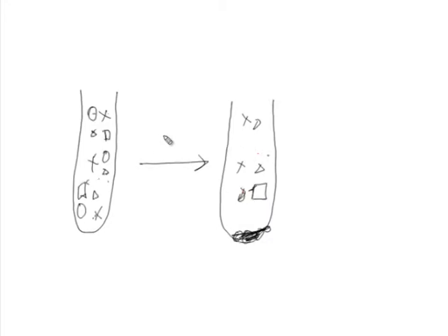So, why do you get partial purity? When a centrifugal field is applied, different molecules will sediment at different rates, but these molecules are homogeneously distributed all over the tube. A molecule which is here will experience a particular force, and the molecules already present at the bottom will also experience a certain force. So, the larger molecule will travel down here, but the molecules at the bottom will also travel down here.